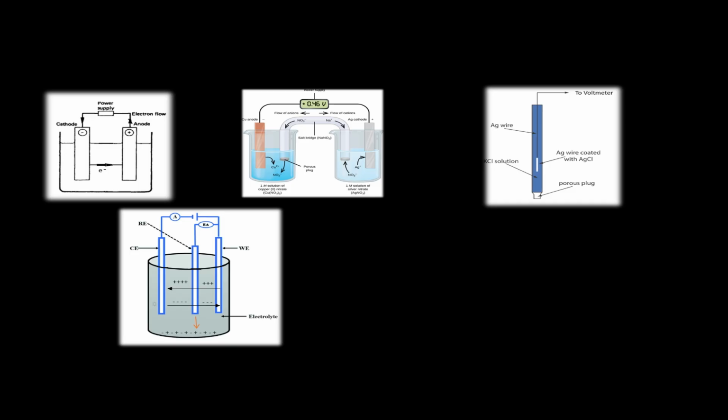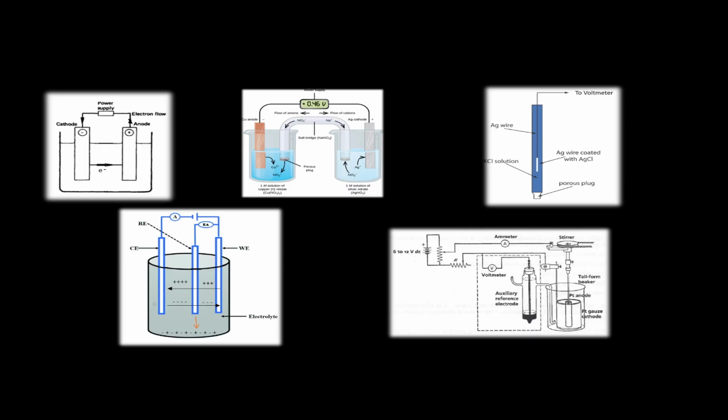If the electrode was placed into a single cell directly between the cathode and the anode, the voltage at that point of contact with the solution in the cell would register a voltage at that point or location in the electrolyte. It is used to monitor and to adjust the voltage within the total cell as the reaction continues without any other premature reactions, such as co-precipitation of an element. A typical lab setup is shown in the illustration.